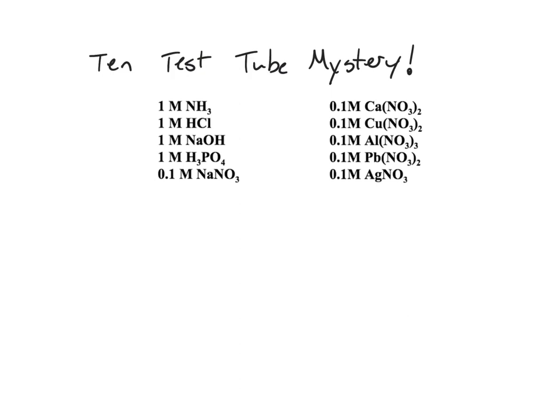All right, everybody, it's time for lab number 6, the 10 test tube mystery. What you see in front of you is a list of compounds, and these are going to be the compounds inside the test tubes tomorrow. Your job is to identify what's in each test tube.